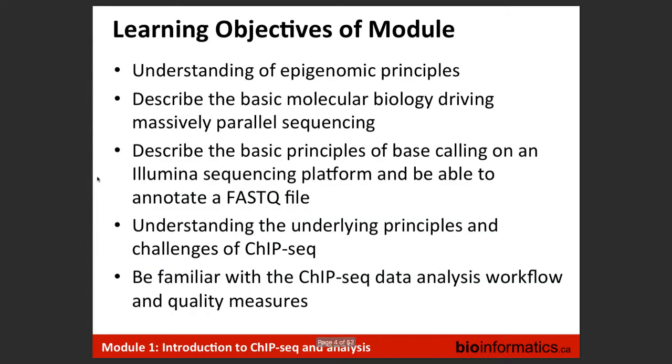All right. So in terms of what I'm going to be talking about today, again, I'm very briefly going to go through some epigenomic principles. What is epigenomics? Why do we study it? I'm going to describe the basic molecular biology driving massively parallel sequencing. So this is the technology that really launched the field. I would argue that the reason most of you are here is because of the development of massively parallel sequencing. If it wasn't for that, we wouldn't be looking at the epigenome.